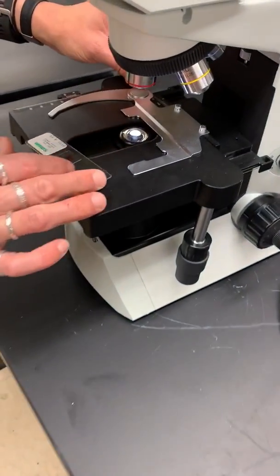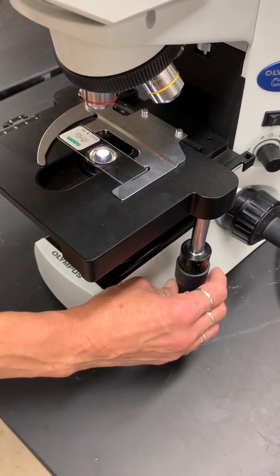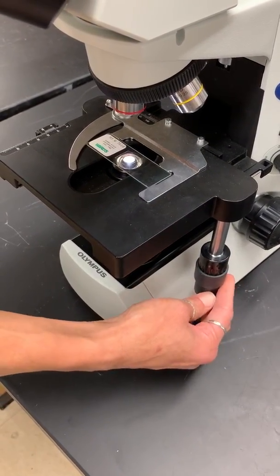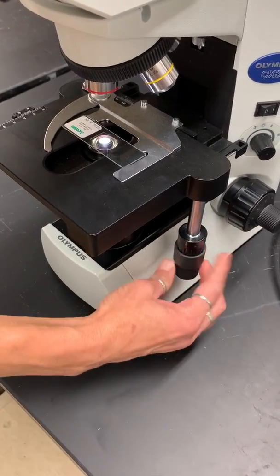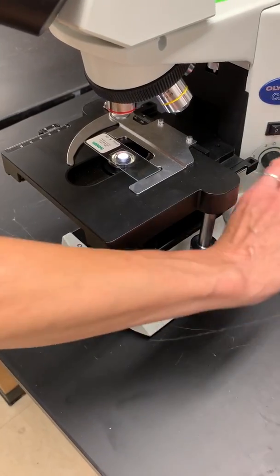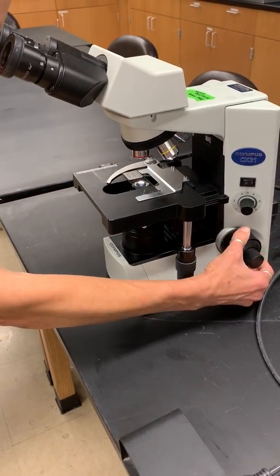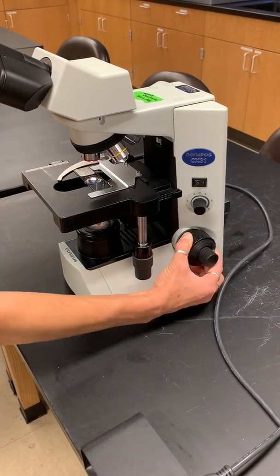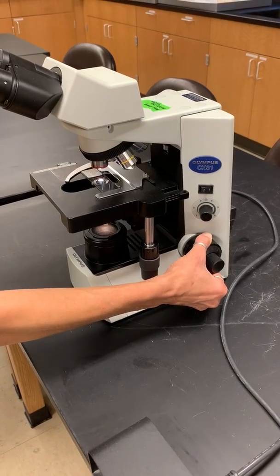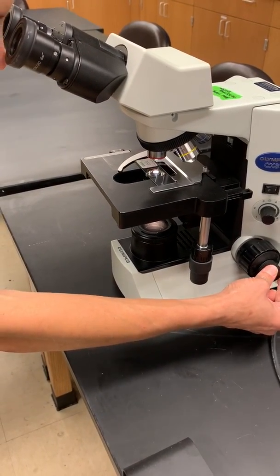I'm going to put the slide on the stage. There's a little clip where we secure it. Then we're going to move our slide so that the specimen is right over top of the light. You can move your slide back and forth and sideways with the positioning knobs on the right side of the stage. Then I'm going to use my coarse focus — my big knob — and move it up until I start to see something through the eyepieces. Once I see something, I'm going to make it even more clear by using my fine focus.